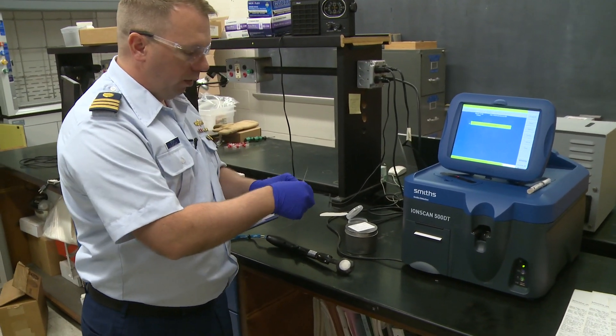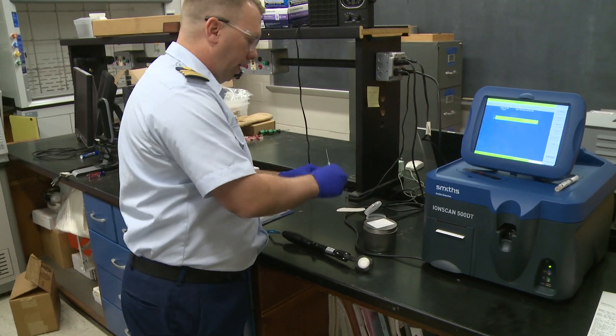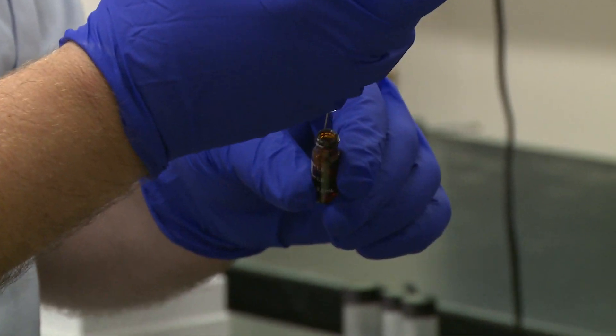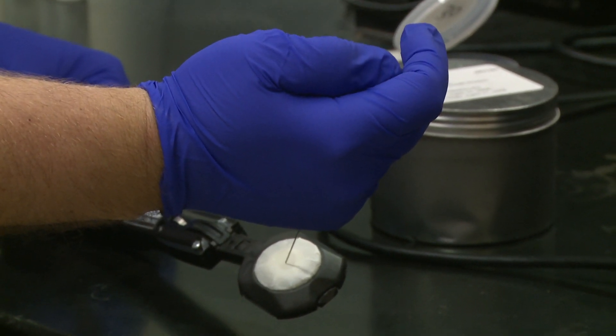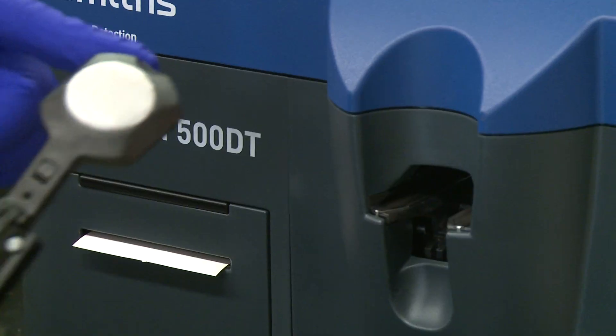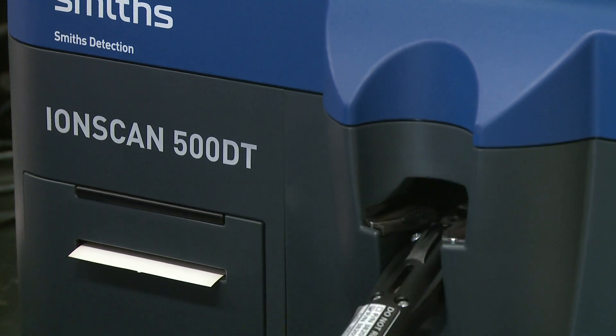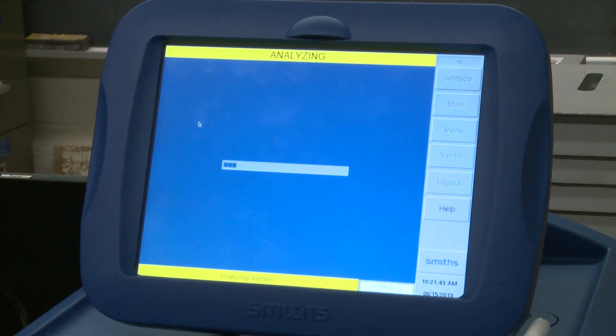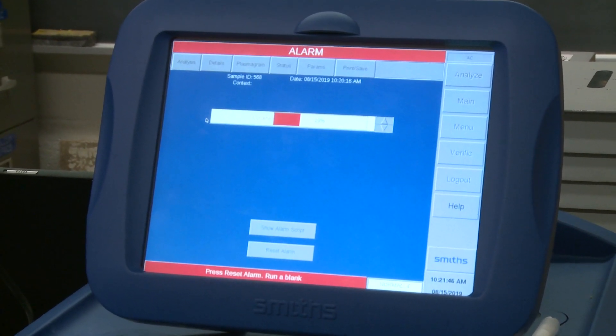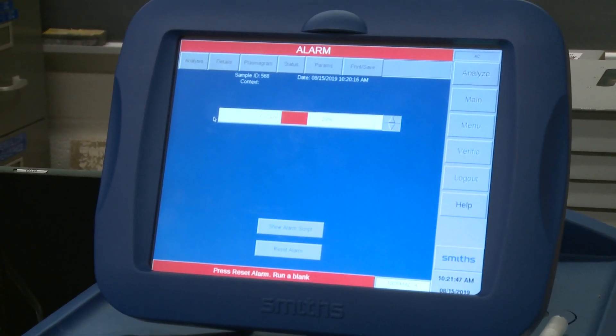Here we have a tiny little bit of cocaine in a solution. We take a little bit of that and apply it to our swab. And it tells you that there was cocaine on the sample.